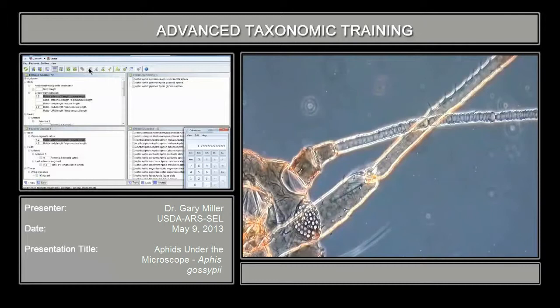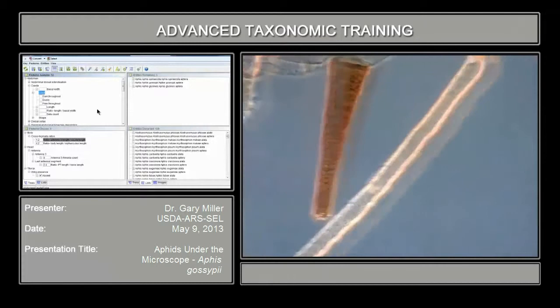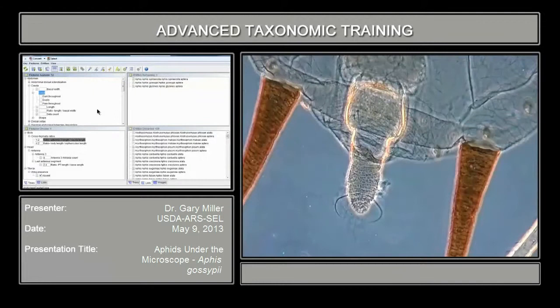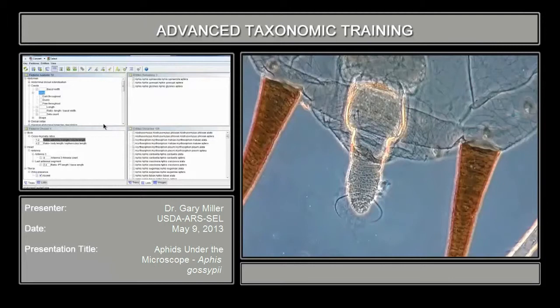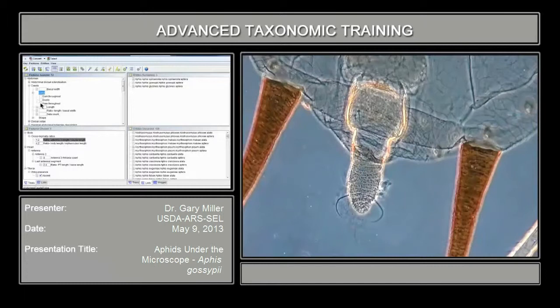Now we're down to the cauda. We're asked whether the cauda is dark throughout, dusky, or pale. This is sometimes a hard call to make with stained or slide-mounted specimens. In this case it's certainly paler — a good comparison is the cauda color in relation to the siphunculi, and you can see it's pale compared to the siphunculi. So we'll click on pale.